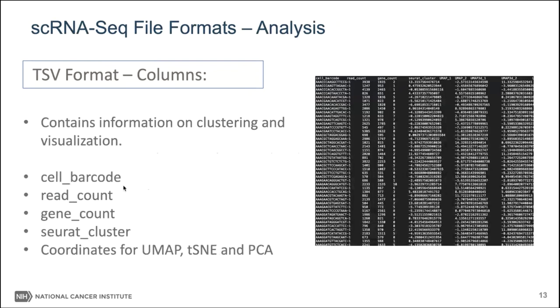Next is the analysis file. This gives you the information on how to visualize and where the clusters fall based on their transcription profile.